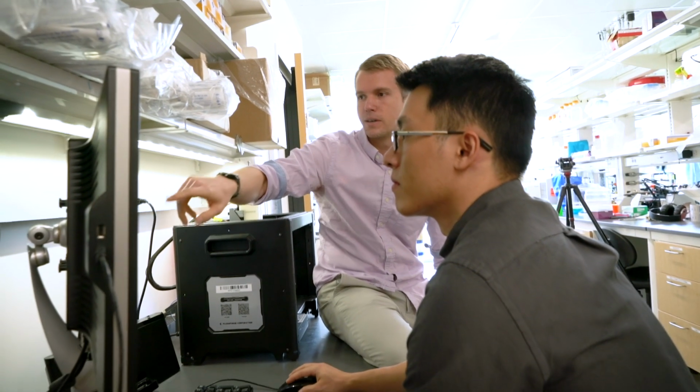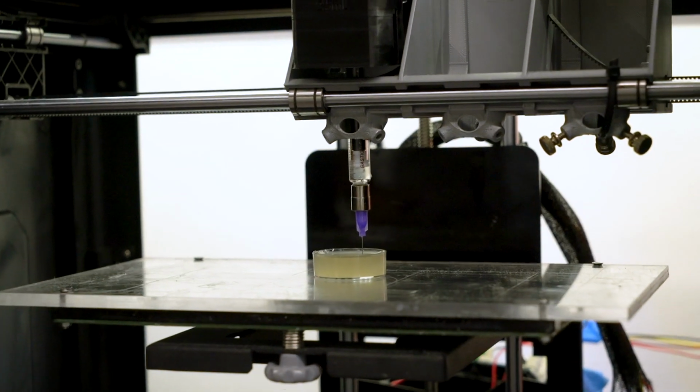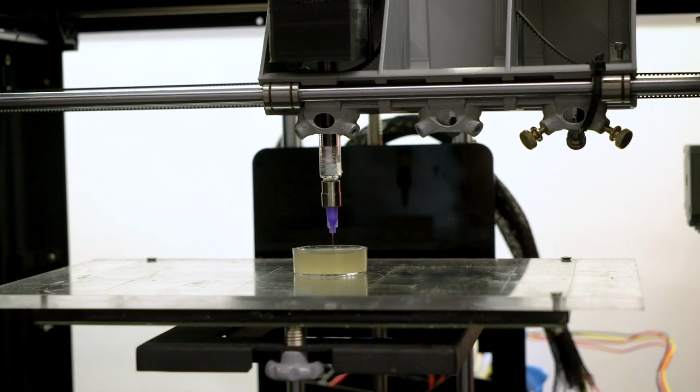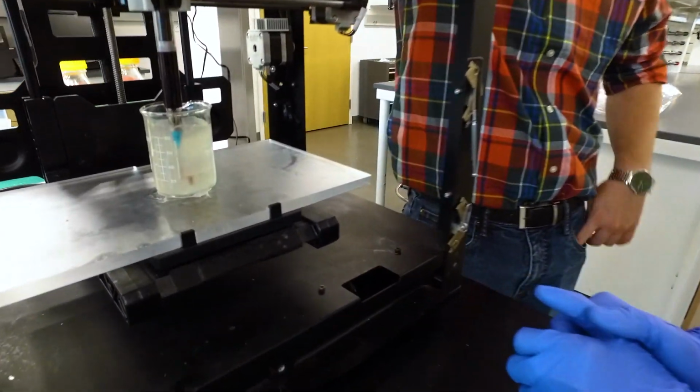What we're doing with the research in our lab is taking these critical steps, showing that, number one, we can print things out of cells and collagen, the main extracellular matrix component of the heart, into things that truly function, like a heart valve, like a small beating ventricle. And so while we've not yet achieved printing a whole adult-sized functional heart, what we've done is really taken critical steps along that path.